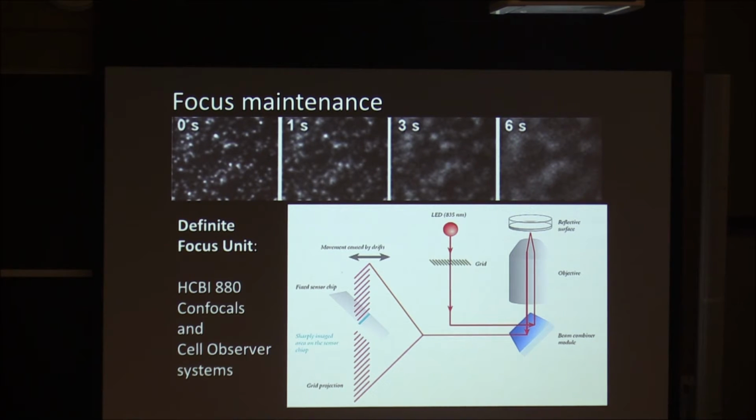There's also some other methods that are built in the software too, just doing a simple software autofocus, so just doing a Z-sec, finding where the best contrast is. Those are options as well, and you can combine them as well.